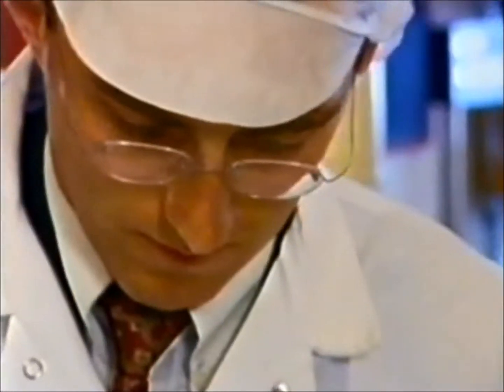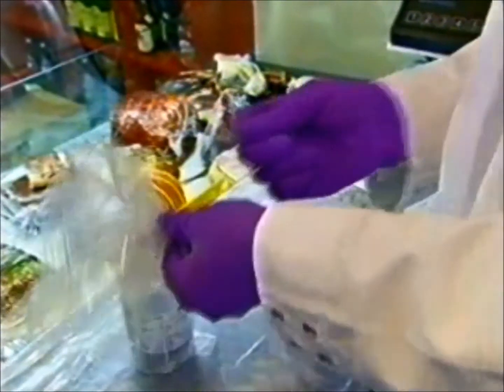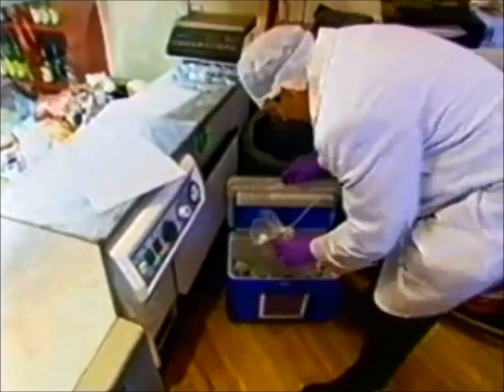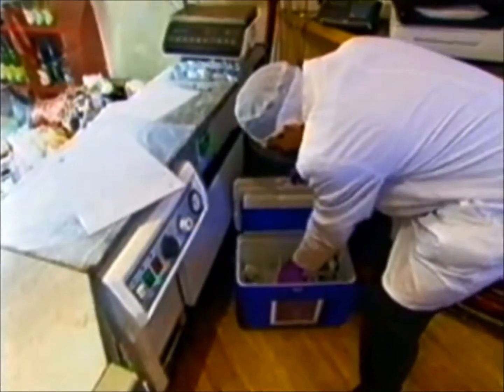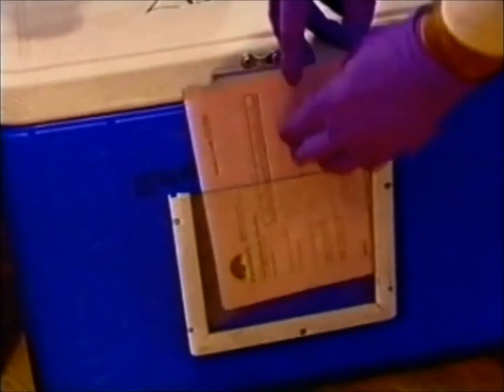Once you've completed taking your samples, you need to make sure that you've done everything you can to maintain continuity of evidence. You need all the information taken at the time of sampling that the food examiner might require. Then you need to make sure that your samples are sent without undue delay to the laboratory and in conditions that won't influence the growth or death of the bacteria.